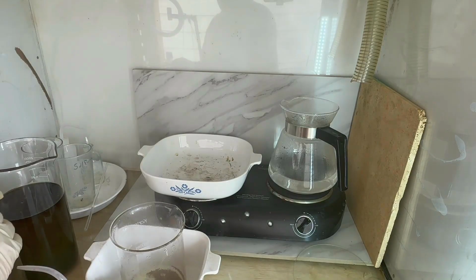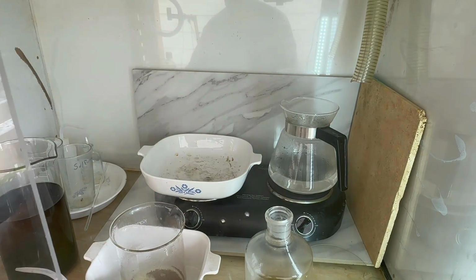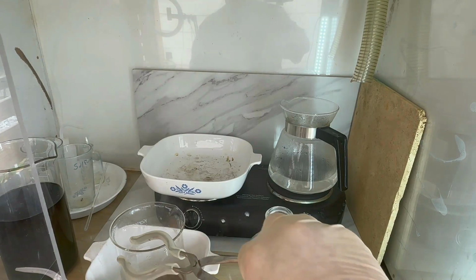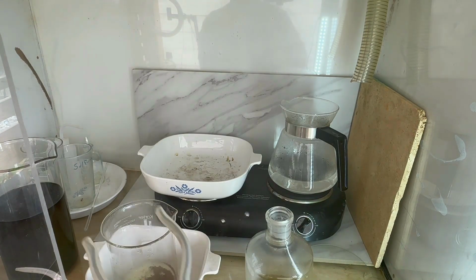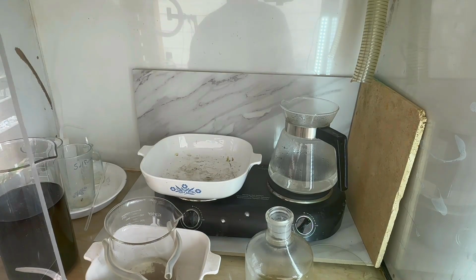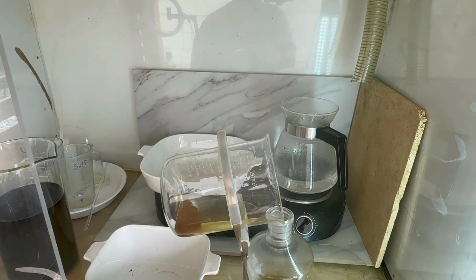Of course, one of the first steps, I'm going to bring up my temporary stock pot that we just emptied. You can see a little fluid in there from the dumping of that original solution after settling. And we're just going to go ahead and get this lined up and take all the rinses, hydrochloric boils, water boils, everything we have right into here.